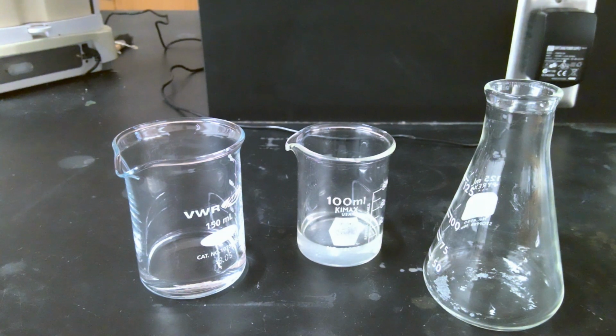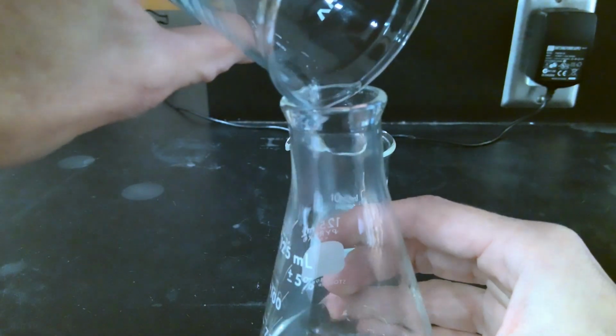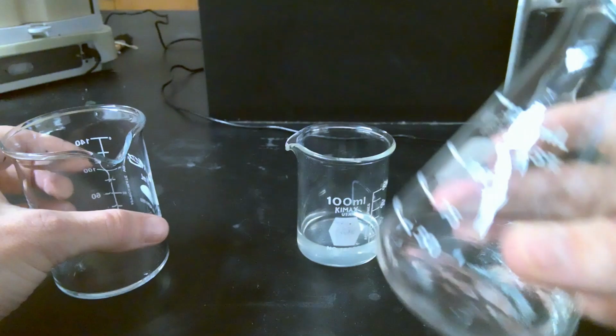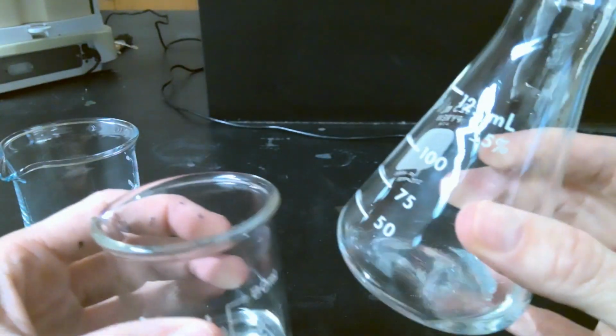Looking back on the prior clip, I realized that I was blocking the decanting process with my hand. So I'm going to rinse the zinc one more time and decant one more time, just so I can better explain what decanting is. When somebody decants, what you're doing is you're carefully pouring off the top layer.